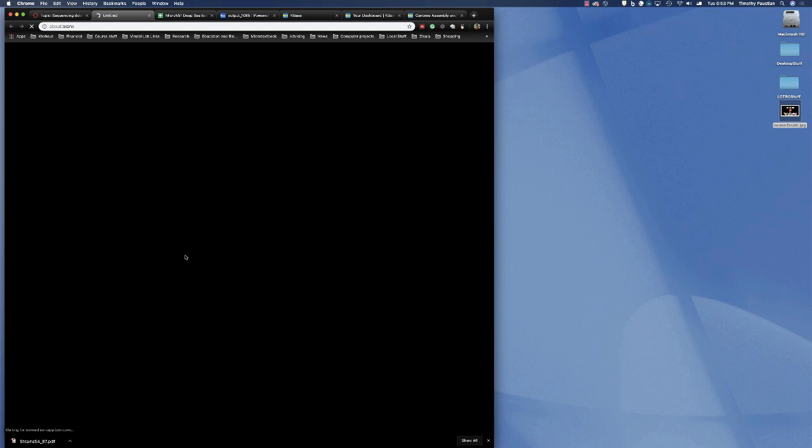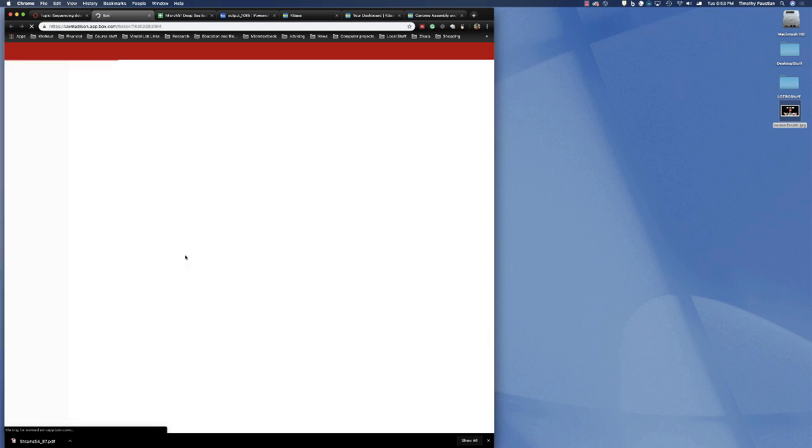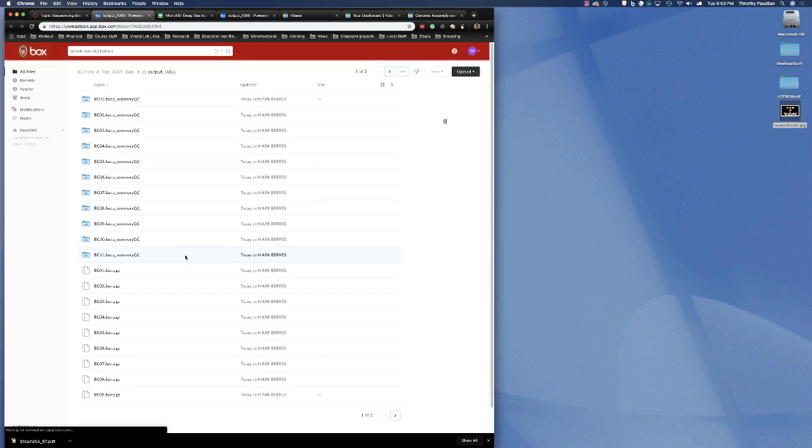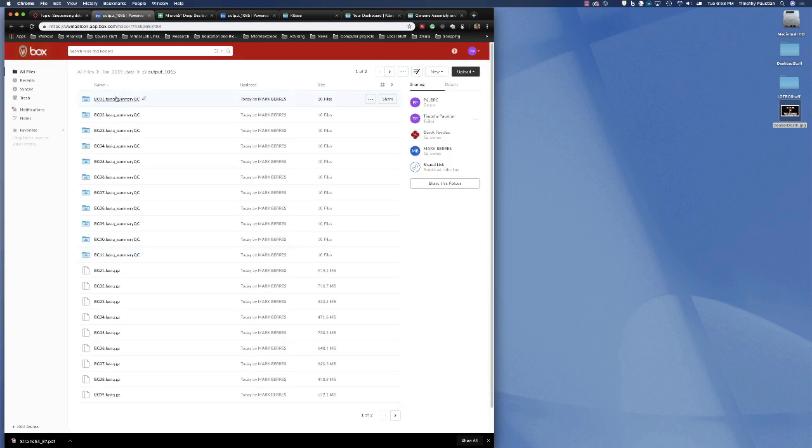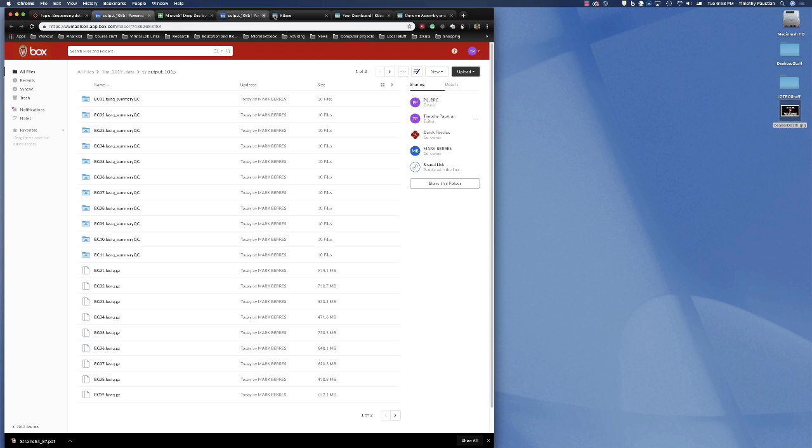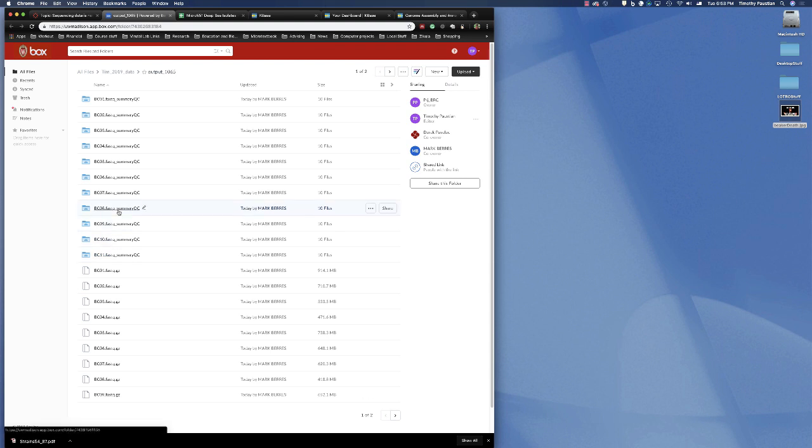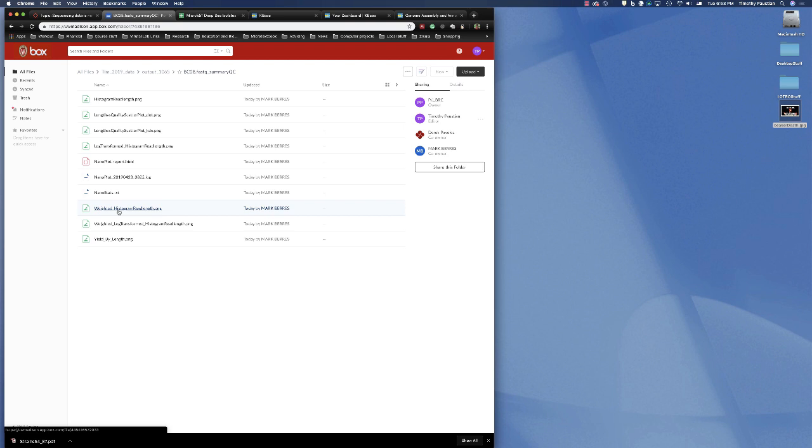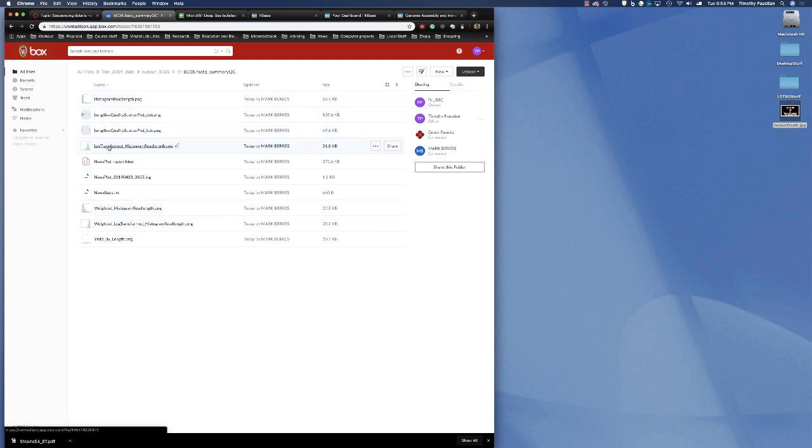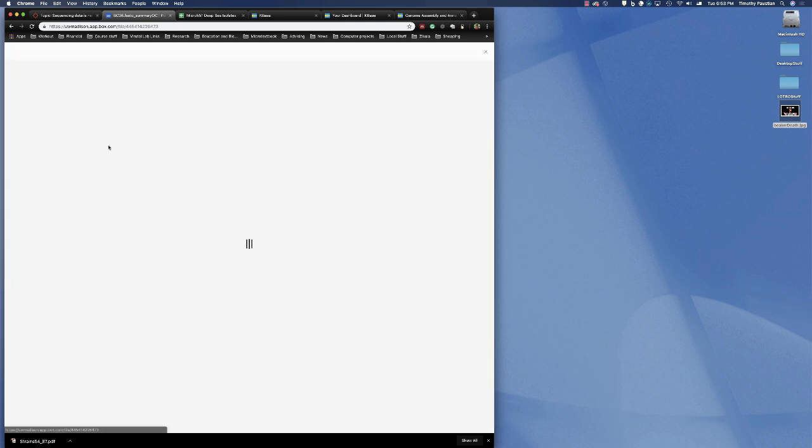So we'll go to our special box account. And we open up the box account. And here is all of the data. So, if you look into the summary files, let's do BC08. And it will show you a bunch of different read lengths, different diagrams. Lots of them will give you information about them.